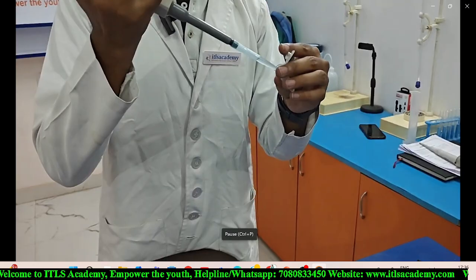So here you can see we discard the supernatant and now only the pellets remain there. By the same procedure we need to discard the supernatant from all the eppendorfs and after that we work with the pellets. So after discarding all the supernatants, only the pellets remain here.